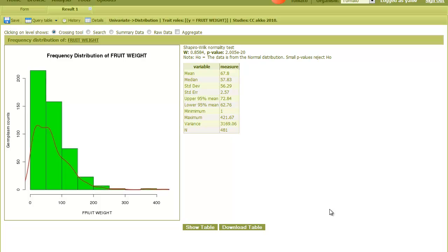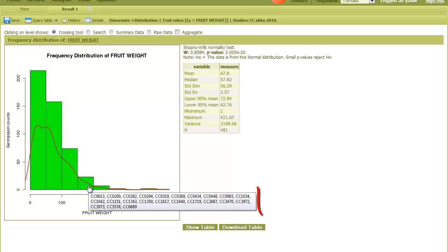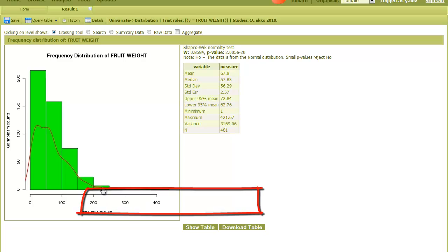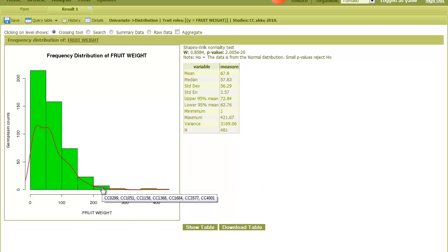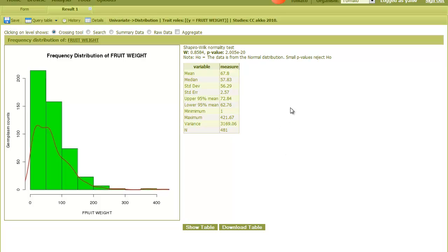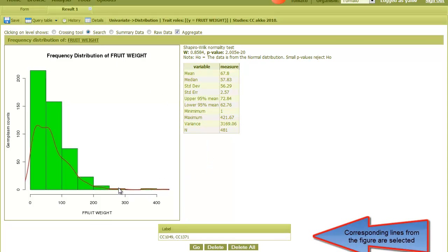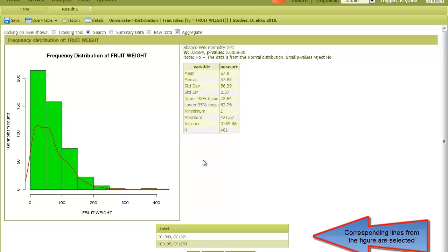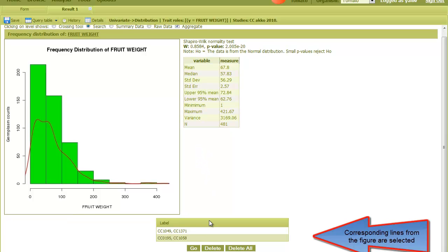I can point on each bar to see the genotypes that are found in that range. Also, I can select them from the figure. When I click on a bar like this, the genotypes within it are aggregated on the list.